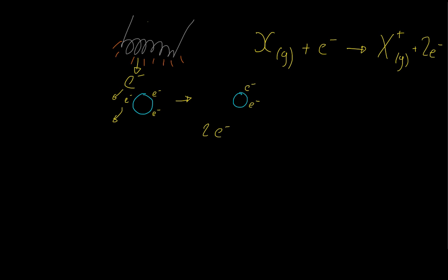Now let's look at the acceleration. If I just rub out this stuff here. The acceleration is done by having our charged molecules, which I'll again represent with this, which now have a positive charge.